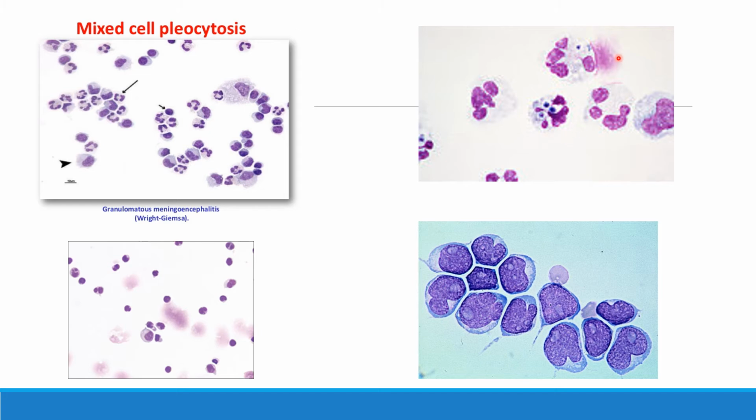There's another vacuolated yeast cell up here where the white cell is trying to destroy these. Okay, so in this case we know that the patient has a yeast infection, and we know it's an infection because the white cells are attacking it, and we can see the yeast cells inside the white cells.